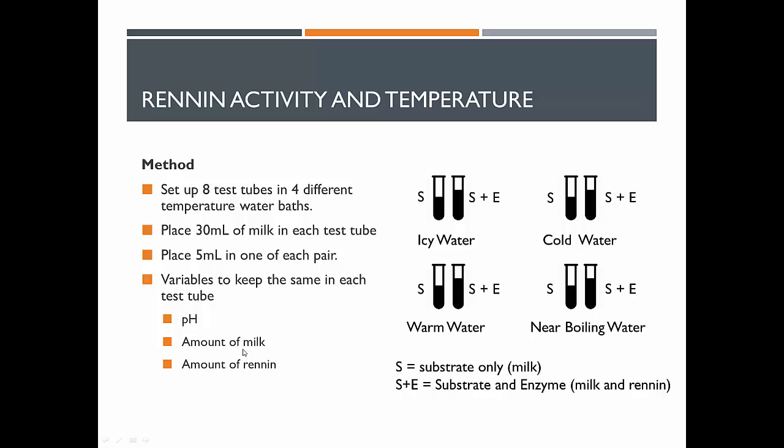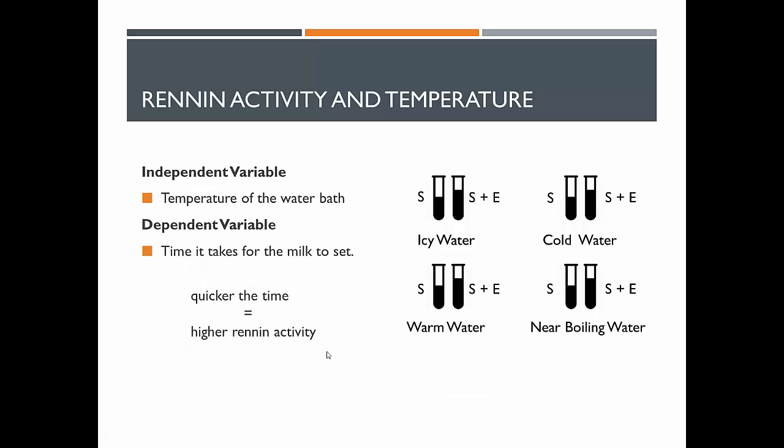We're going to carefully measure the amount of milk so that we don't have an excess amount of substrate or less substrate in here. And we're going to carefully measure out the amount of rennin, and I'll show you a technique in the lab when we do that. Alright, so there's your experimental layout. Let's have a look at this.